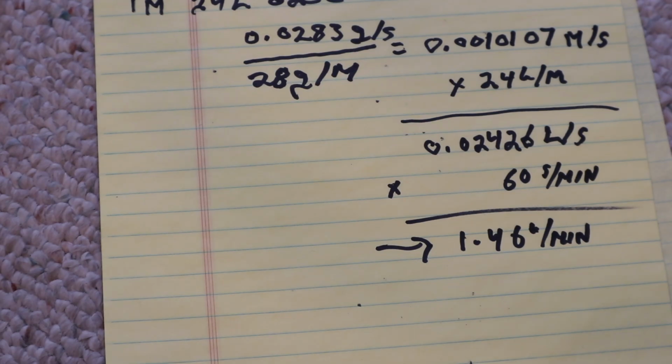I will not create a vacuum because I will be condensing the nitrogen as fast as I'm feeding it into the thermos. Now what I'm going to do in practice is go a little above this. So I'm going to feed in 2 liters a minute, which should be more than enough to overpressurize the thermos and not worry about entraining any room air that contains carbon dioxide and water vapor. So this gives you a ballpark of what you need.